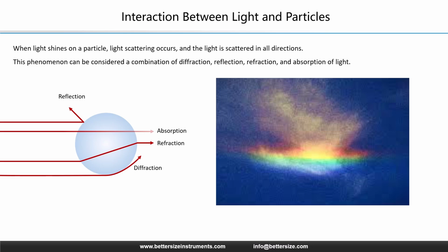While the industry calls this laser diffraction, we are actually capturing the sum of all these interactions, which we call light scattering. All of this scattered light travels outward to create a unique pattern like the one you see on the right. This pattern is the fingerprint of the particle, and as we will see next, the shape of this fingerprint tells us exactly how big the particle is.